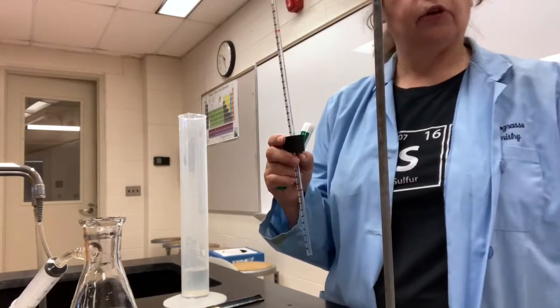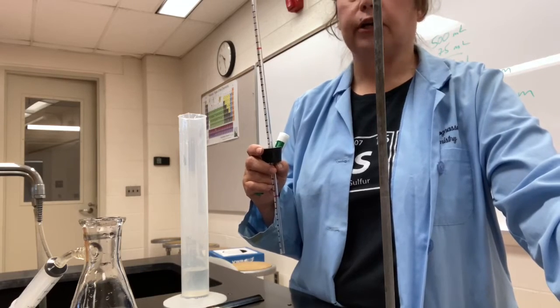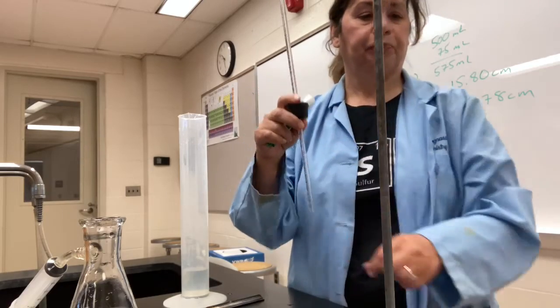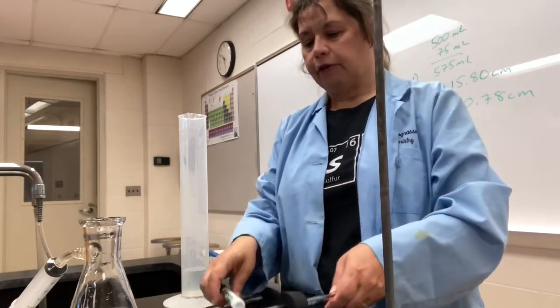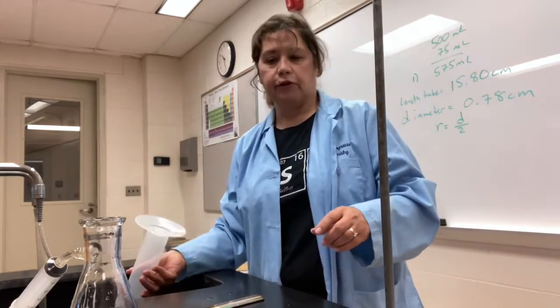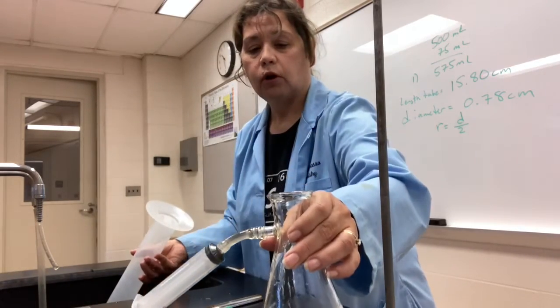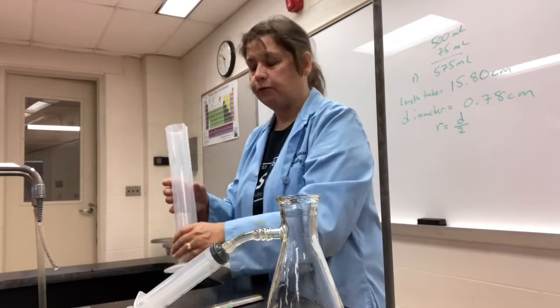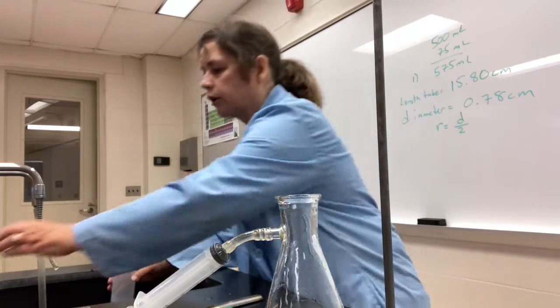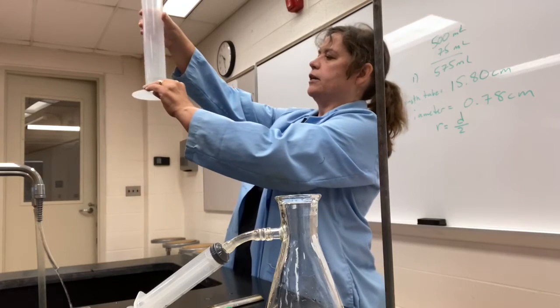If you look at your data sheet, the volume of the tube would be listed on line 4, and you'll see the formula, length times pi r squared, to calculate this volume. Now, to get the volume of the air in the flask, we have to take into account one more thing. Remember, in my first discussion, we said that there's going to be water in the flask, and the water will then be pushed up the tube as the pressure increases inside the flask. We have to add 50 milliliters of water into the flask in order to accomplish that.